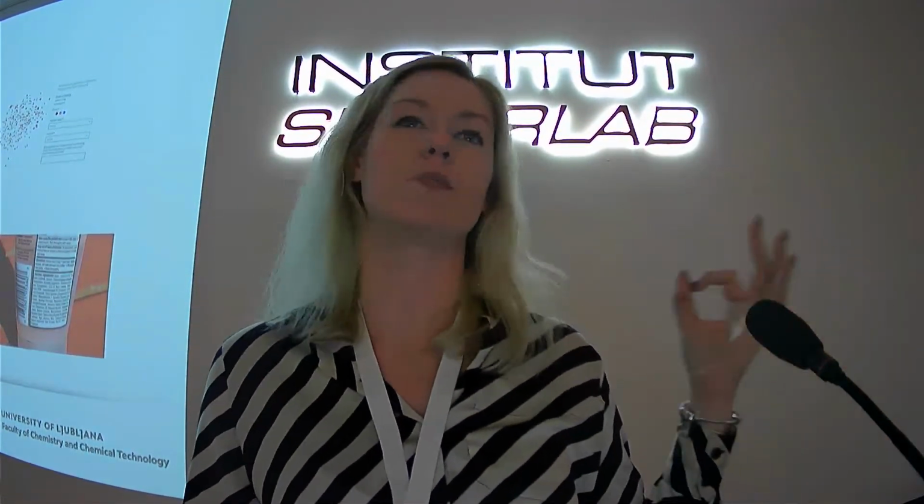So the preparation. In the past, for example, 10 years ago, the majority of studies were using spheres, so these perfectly spherical particles with a specific size, with specific chemical characteristics, usually just pure polymers. But like we already said, this is not environmentally relevant. It's very useful, for example, if you are developing or optimizing analytical methods.